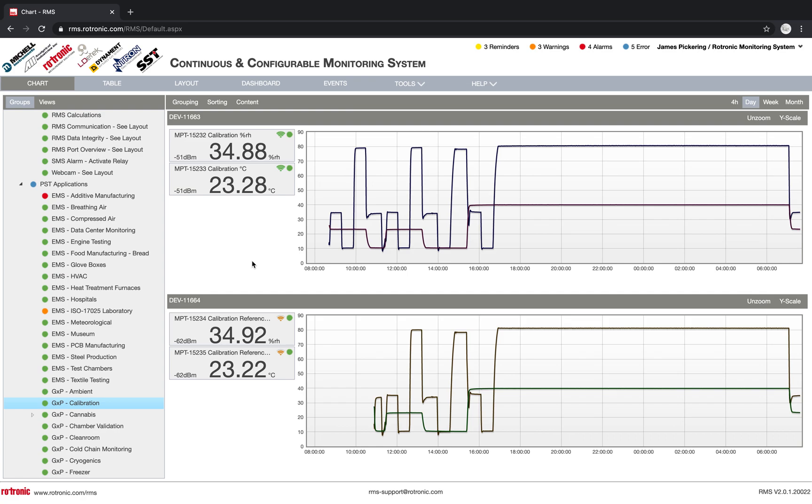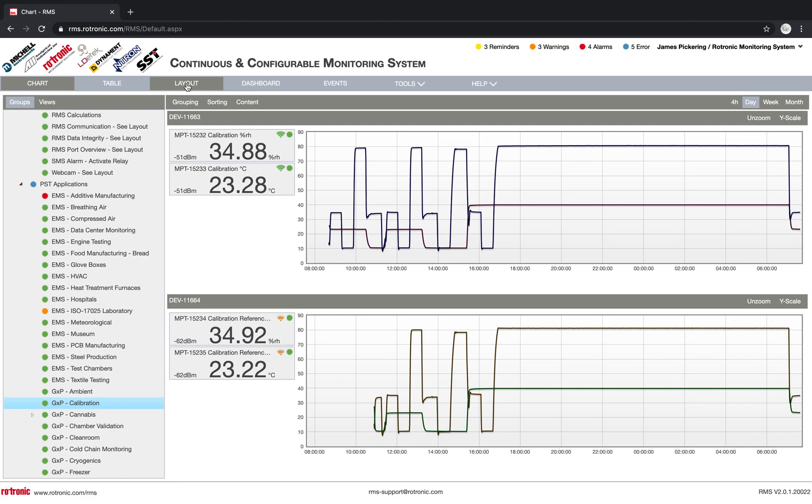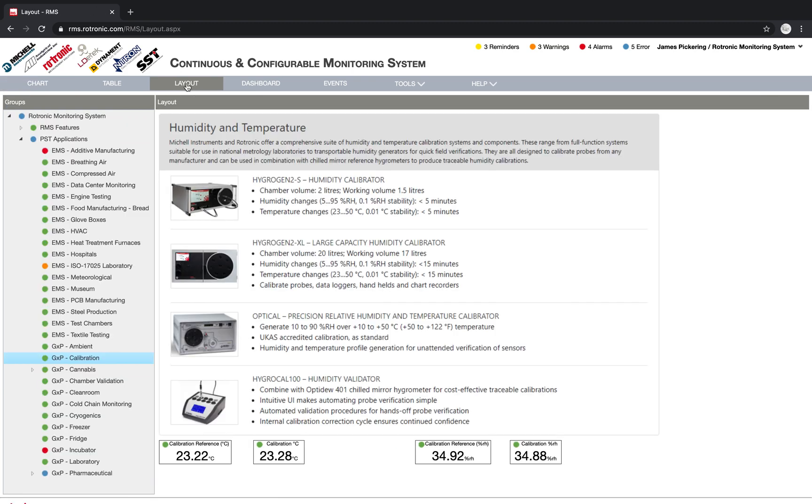The overview here is of the past 24 hours, so the past day. And you can see yesterday already that I was running calibrations in the system. If we check on the layout, we see here the overview of calibration devices for temperature and relative humidity that PST can offer you today. So we have a full range of products. We also have dew point mirrors that can be used as references.